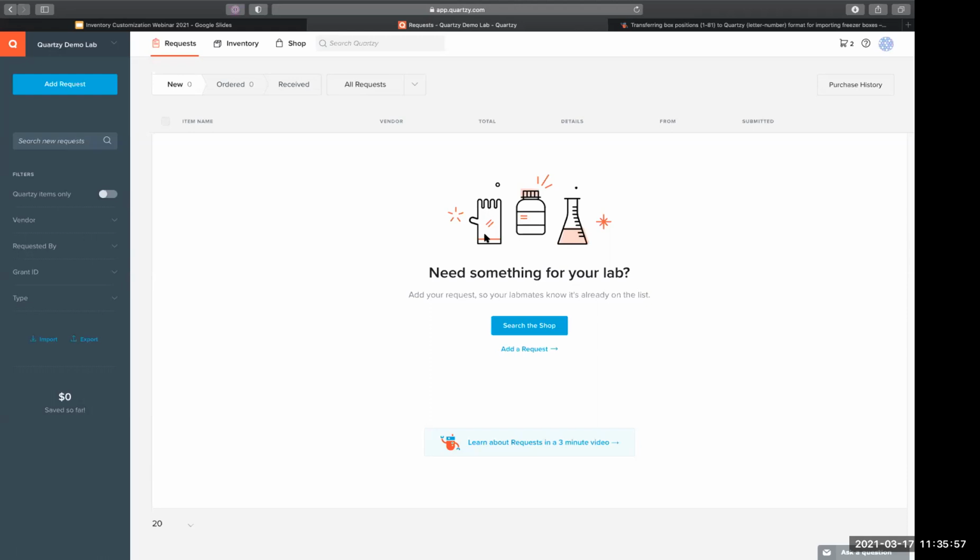But email reminders are not really doing it because, first of all, we already get hundreds of emails from you guys every day. So that's not the point. Secondly, I still have to go in and do it manually. So that still defeats the purpose.